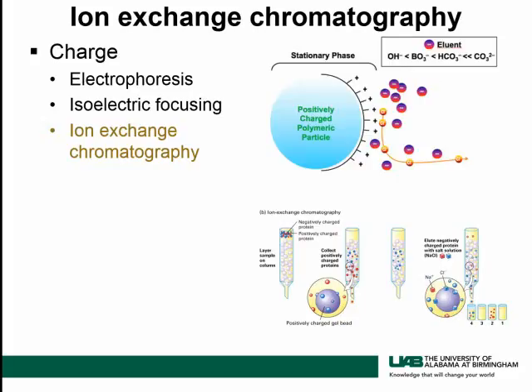And once you wash with a pH that converts your protein, which is bound to the matrix, from negatively charged to a zero charge, that protein of interest is going to be washed off. Okay? There's another way of eluting that protein from the column, and that is, look at this picture.